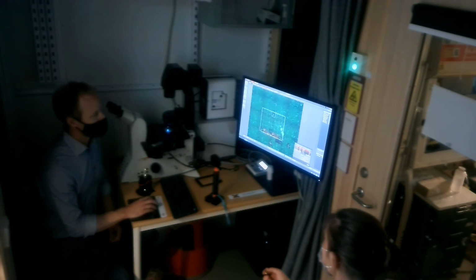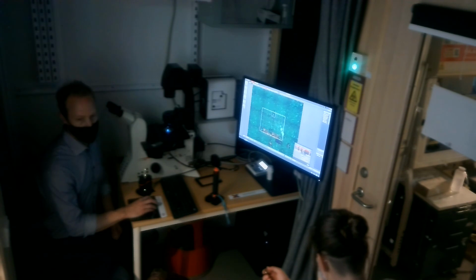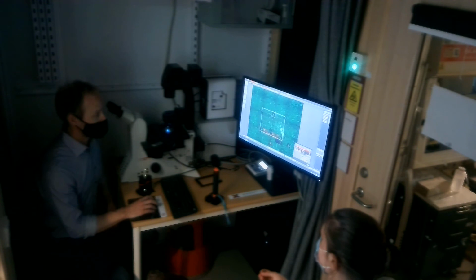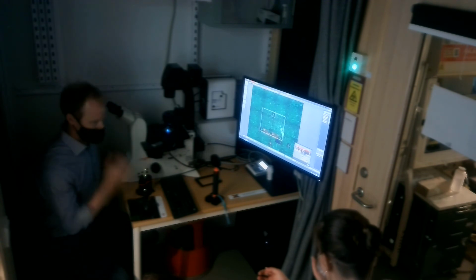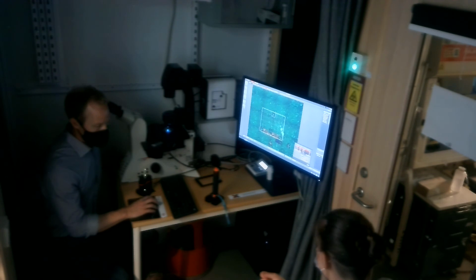So even if I take an image out here, then it will use these numbers to calculate what the focus is out here. So it will do a job for that. But I would say continuous, so if there is a tendency of getting out of focus towards the upper point, that if you use that tendency or just choose the same polygon or same map again.